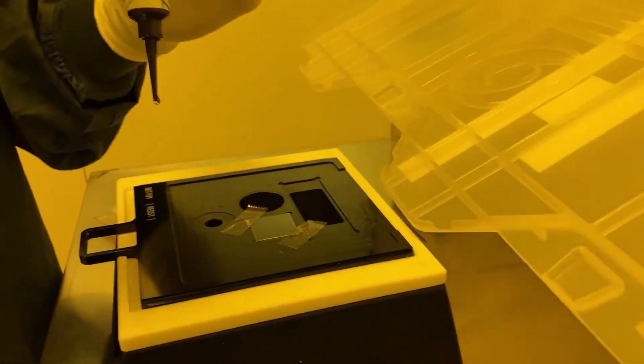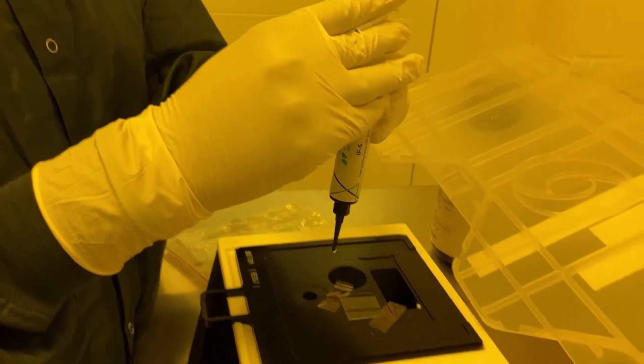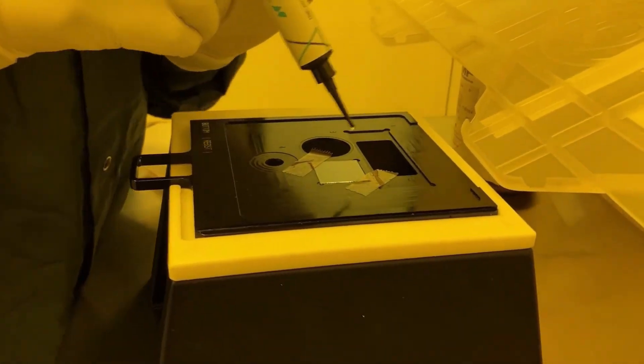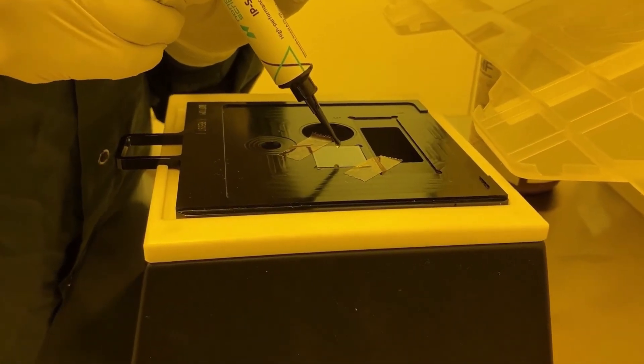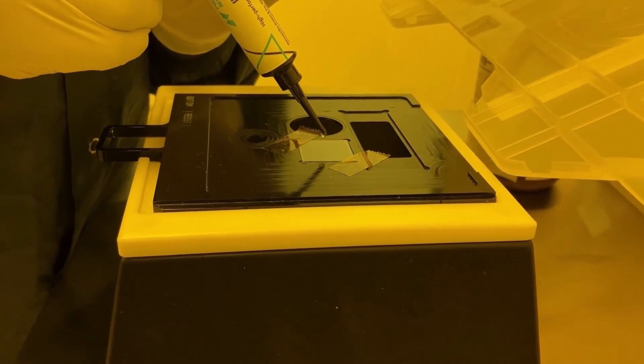Next, take the resist you will be using. In this case we are using IPS. Add a small drop onto your substrate. It does not take much as most prints are in the micro scale.